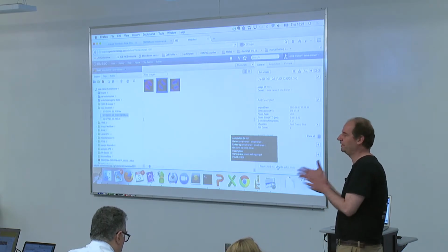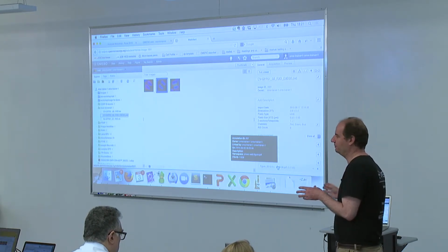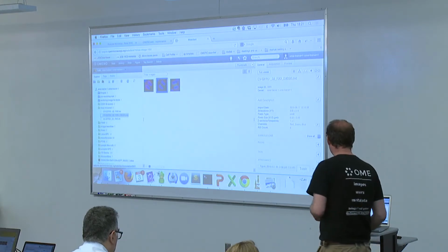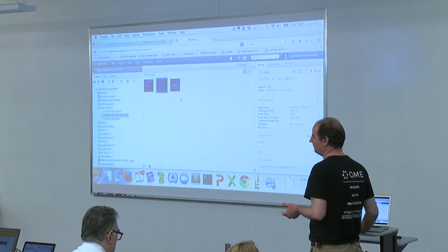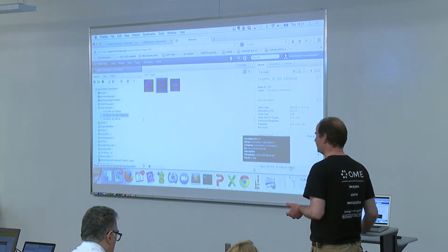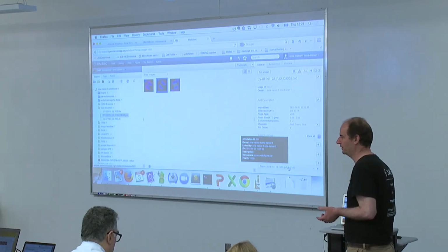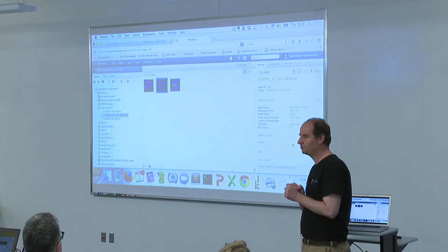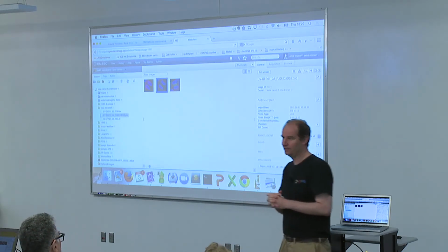So obviously the workflow is you send it to the journal, and the reviewer says you have to exchange this image, or you have to give me a bigger zoom. Then you obviously don't know anymore what image that was. So that's how you get to that. The figure is actually also here on the image, so you can go the other way. You know that this image is in the figure, but you don't know if you published it already. That's where the attachment is, which strongly hints that you probably already created a PDF and you should think what you've done with the PDF. So that's the OMERO figure. I think I told you what I wanted, and I will be happy to take questions. As I say, there is one more lightning talk tomorrow at 3:40, so happy to see you there.